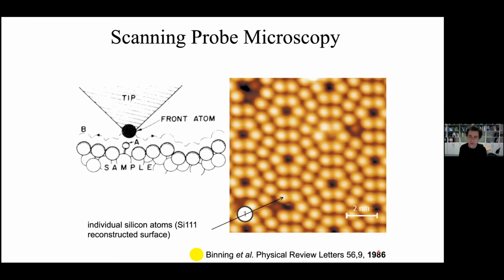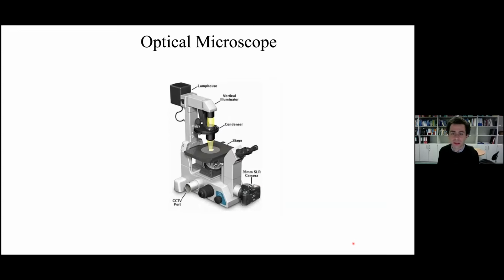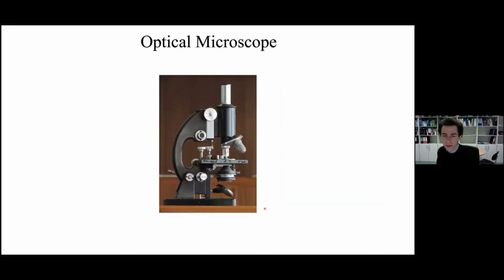Optical microscopy, on the other hand, relies on an instrument, on equipment, and also on physical principles, which are the same since its invention. So the microscope of today looks very similar in concept to one of the early microscopes from a century ago. Well, the first microscopes date back to the 17th century, but actually what you can image with this microscope, if you may remember, or at least this was my initial experience in high school, where I was using a microscope not much different from this one, and I have to say I was not really impressed, are these.